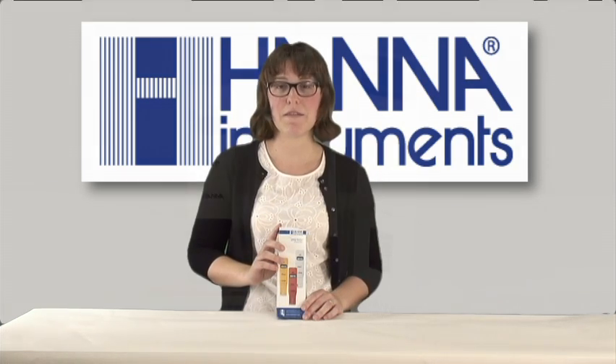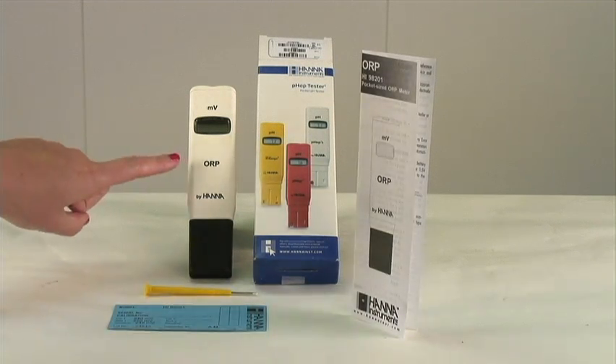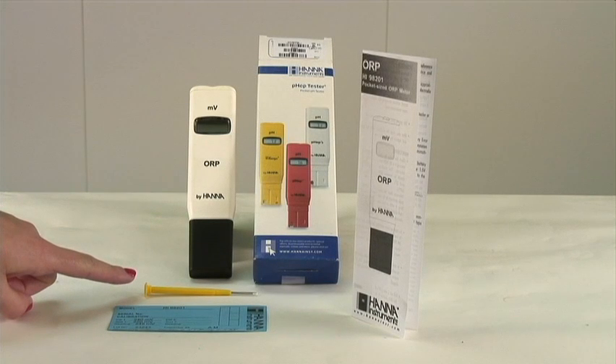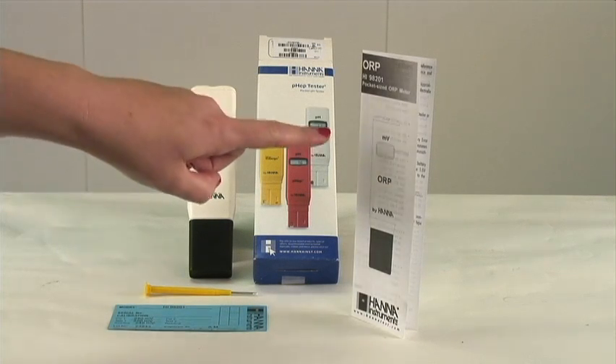When you receive your meter, it will come in a box that looks just like this. Let's open up the box and see what comes inside. There should be four objects within your box: your meter, a general tool, calibration certificate, and your directions.